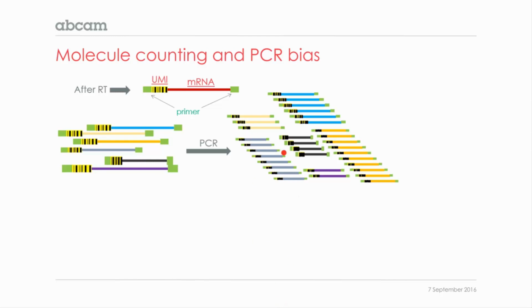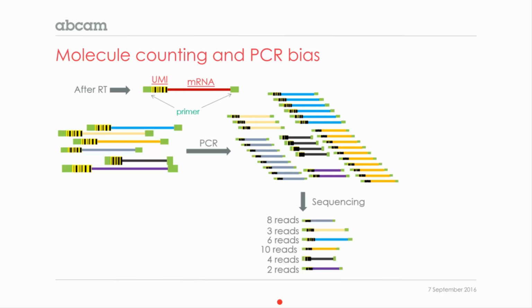So now when we take this pool of amplified cDNA molecules and we sequence them, we get reads, and then we analyze those reads.